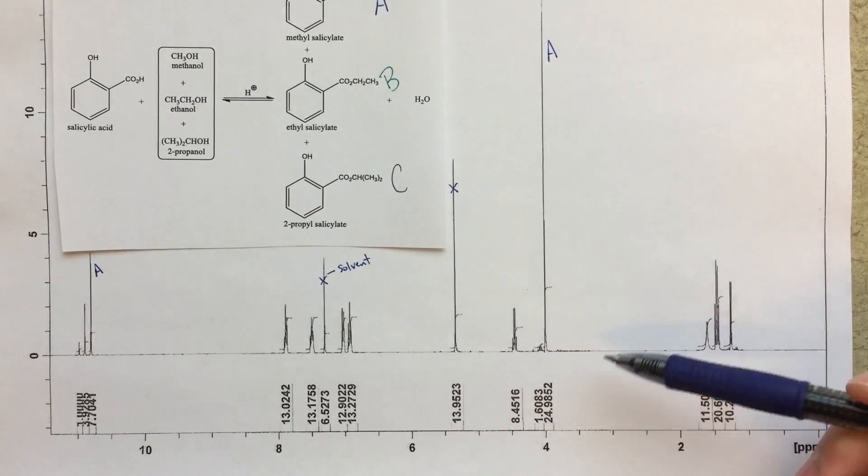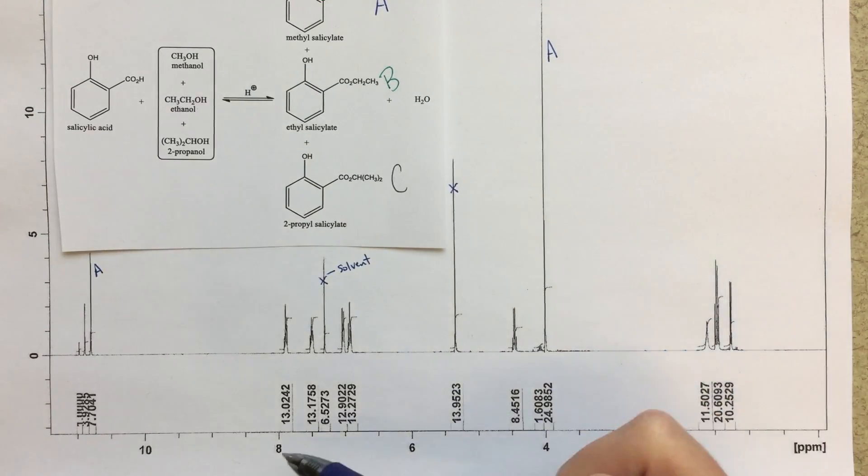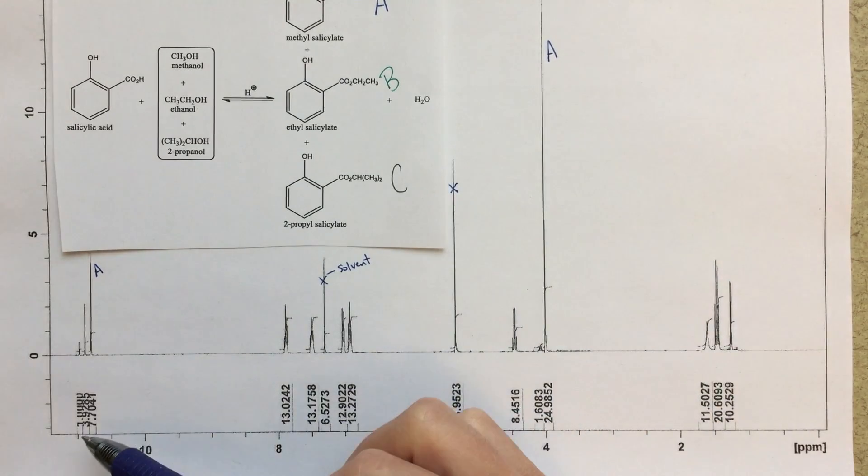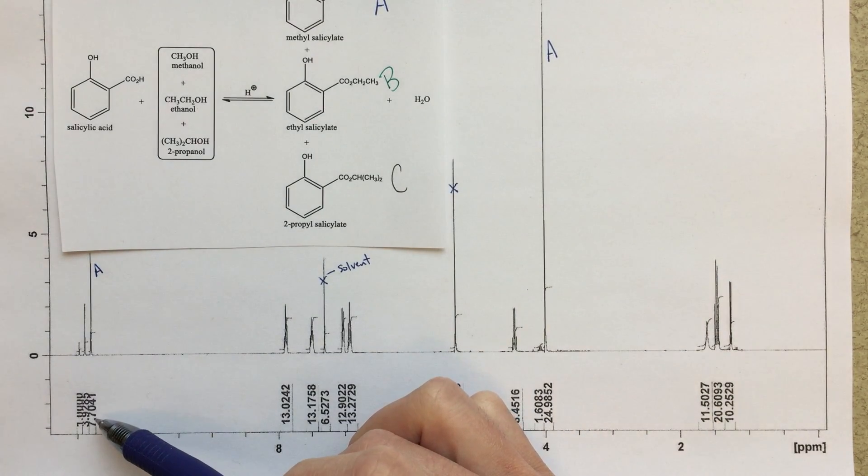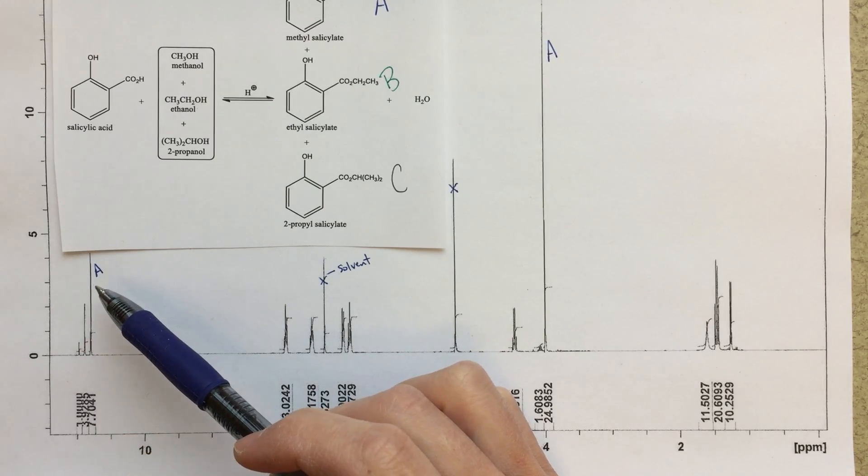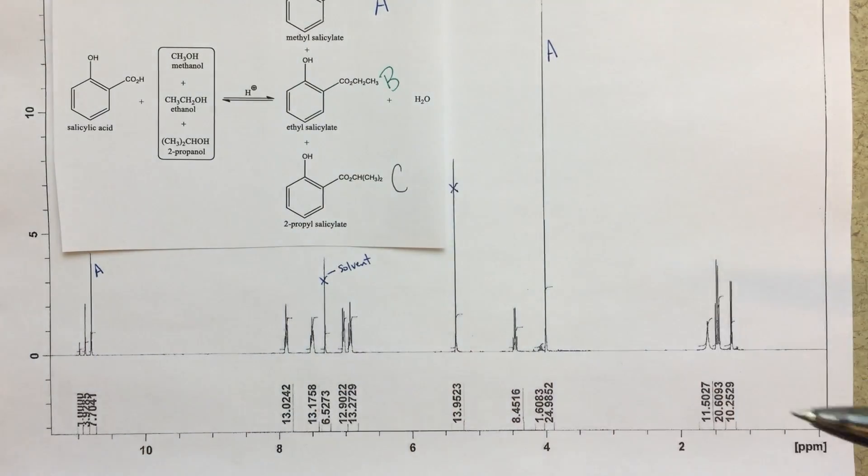So this OH should only be one third the height of this big methyl group. The integrations that we're given, 24.9 and then a third of that will be close to eight, and we've got something that integrates to 7.7 here. So I think that we can identify this peak as belonging to A.